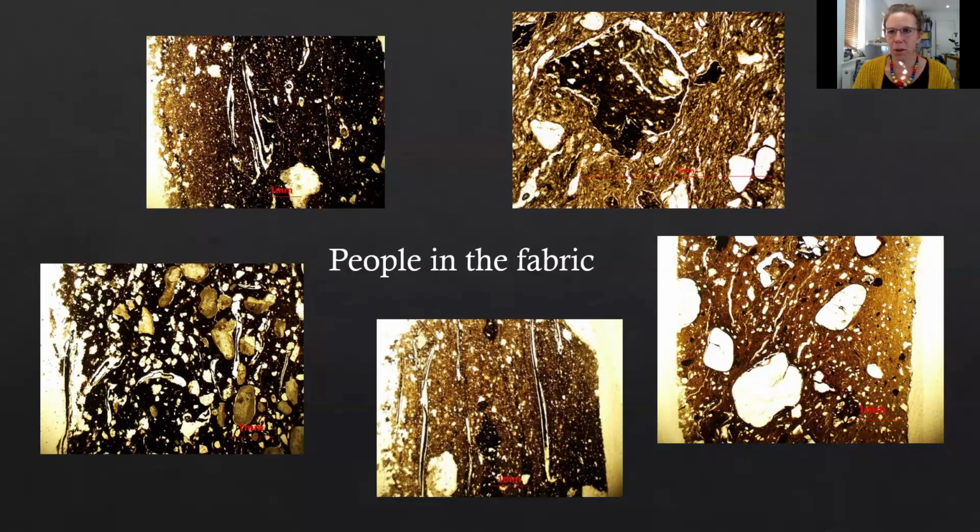Now, the most confusing in some ways is the one on the left-hand side at the bottom, and you might notice on the left-hand slide there are some bent pieces of grass. There are black inclusions, voids that are going in a circle, and also some of the inclusions are on an arc. But if you look to the right, the grass is going vertically straight up.